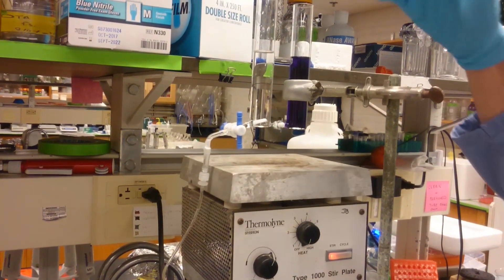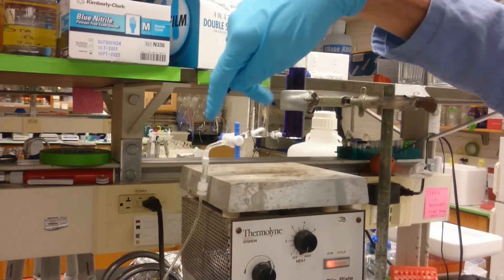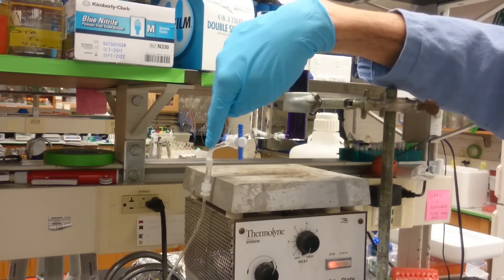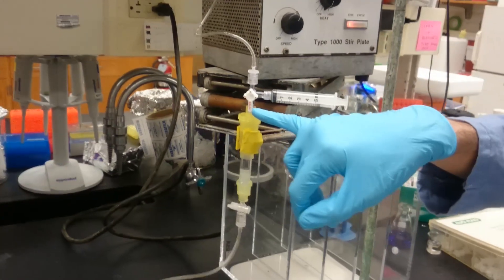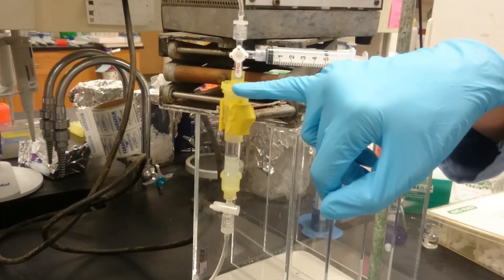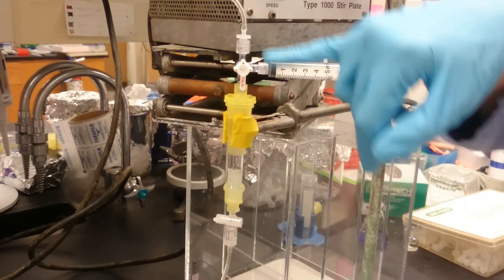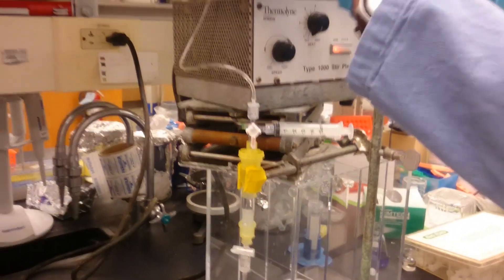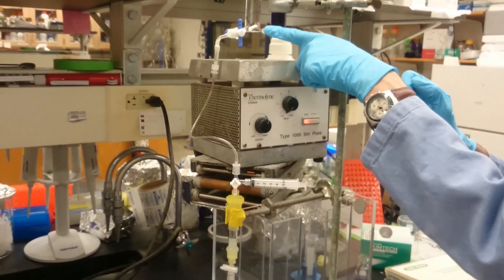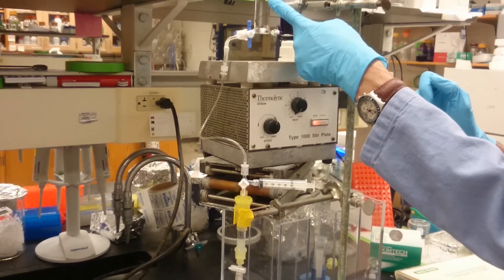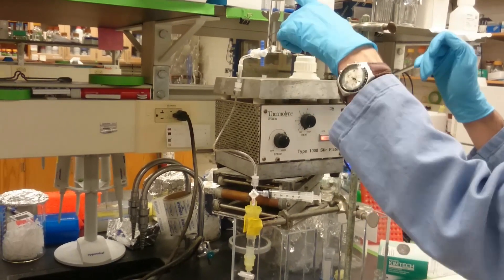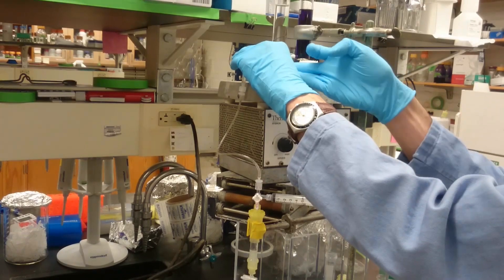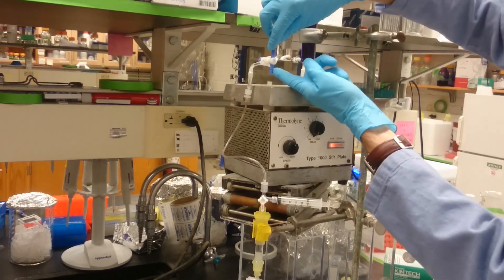So to get this thing started, the first thing you need to do is to prime this line, getting all the air out of it. We do that by using this three-way valve on our column, having it closed to the column but open to the syringe and to the buffer reservoir. I'm just going to start by opening up this one here so that liquid can drain from here into there, and actually I should probably top this off.